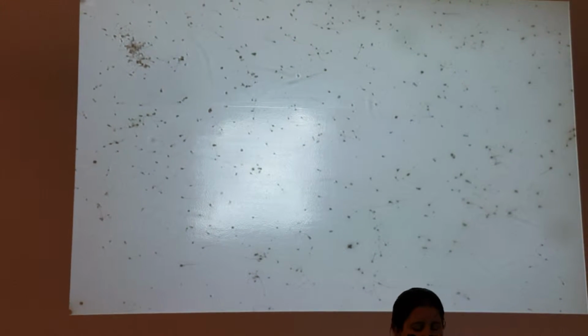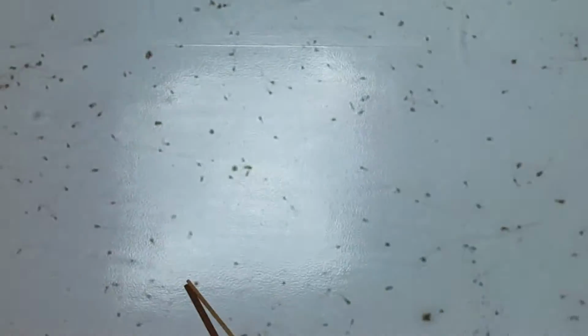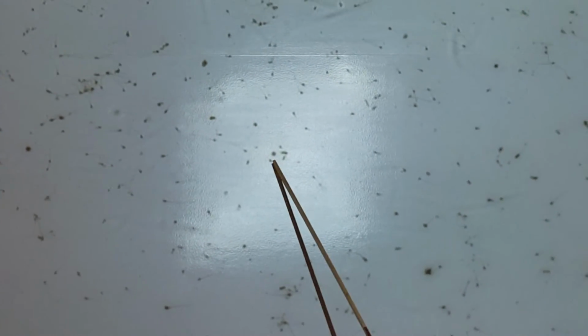Ooh, looking at tadpoles. Ah, they're not tadpoles. What are they? Spermatozoa. So there's two things you have to know on this spermatozoa slide. Head is one, and that's the little dot. And tail is not an option, so it's flagellum, which is the string that comes off at the line. So the dot is the head, and the line is the flagellum. Spermatozoa. Done. Also doesn't look like anything else.